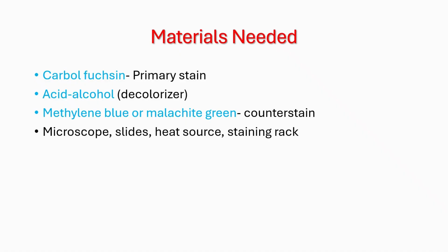You will need standard lab equipment and reagents like carbol fuchsin, which is the primary stain in acid-fast, and acid alcohol, which acts as a decolorizer, and the counter stains such as methylene blue or malachite green. Remember to always follow biosafety protocol, especially when handling pathogenic mycobacteria.